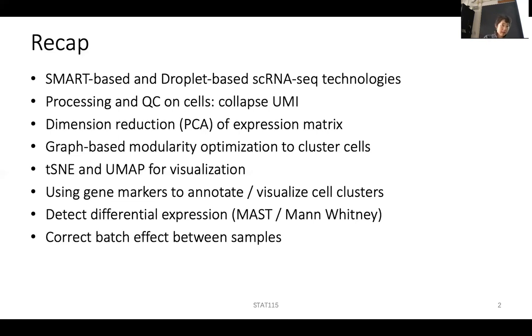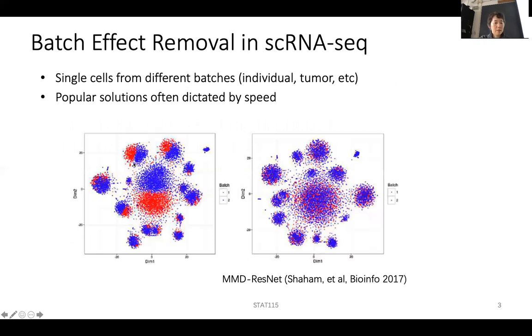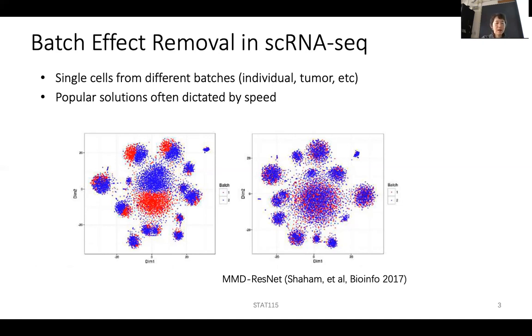One thing you might notice is the presence of batch effects. Within the same sample there shouldn't be any batch effect since everything went through the same droplet process and sequencing. But if you do single-cell RNA-seq from one patient sample and another patient sample through different assays, you do have to consider batch effects. For example, the red cells from one original sample and blue cells from a different sample might cluster somewhat together but don't completely overlap.